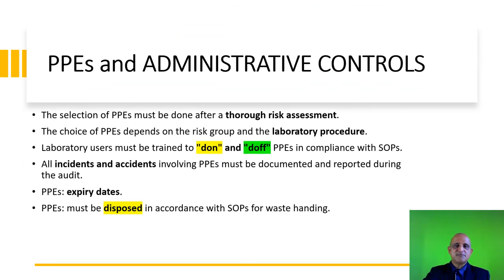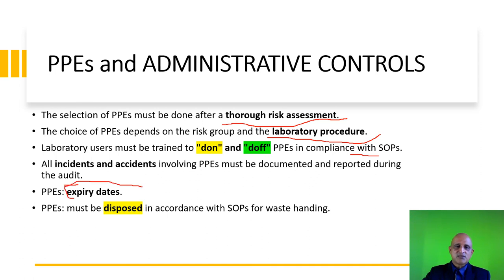PPEs must be used in conjunction with administrative controls. The selection of PPEs must be done after thorough risk assessment — this in itself is an administrative control. The choice of PPEs depends on the risk group and the laboratory procedure. Laboratory users must be trained to don and doff PPEs in compliance with SOPs — donning refers to wearing a PPE and doffing refers to its removal. All incidents and accidents involving PPEs, including tearing during usage as well as expiry dates, must be documented and reported during the audit. PPEs have an expiry date and should not be used after that date. PPEs must be disposed of in accordance with standard operating procedures for waste handling, which may involve autoclaves as well as incineration.